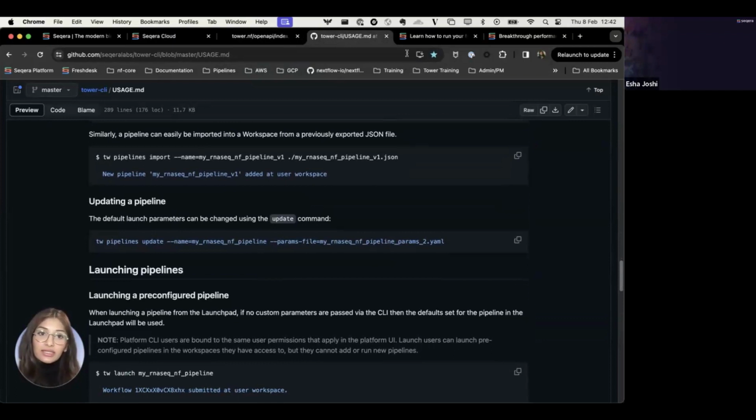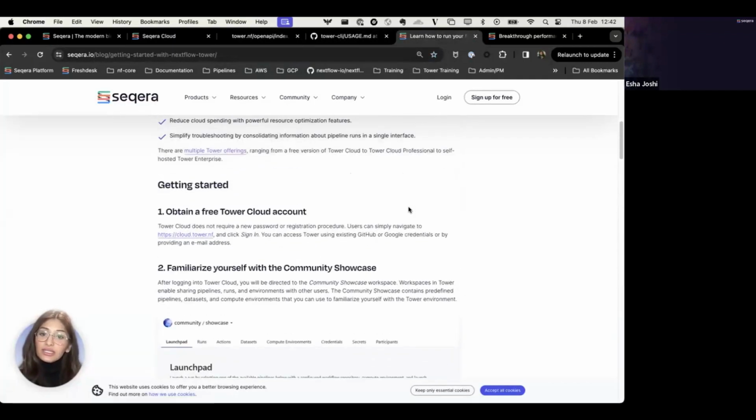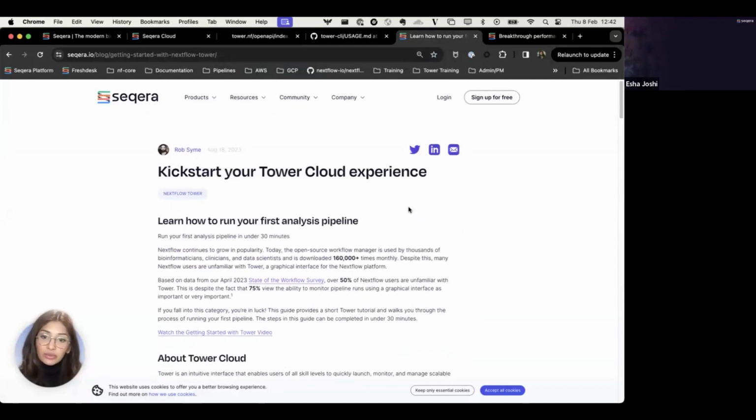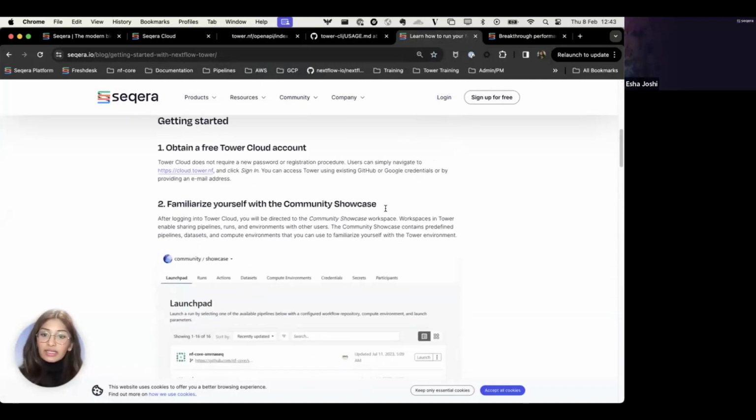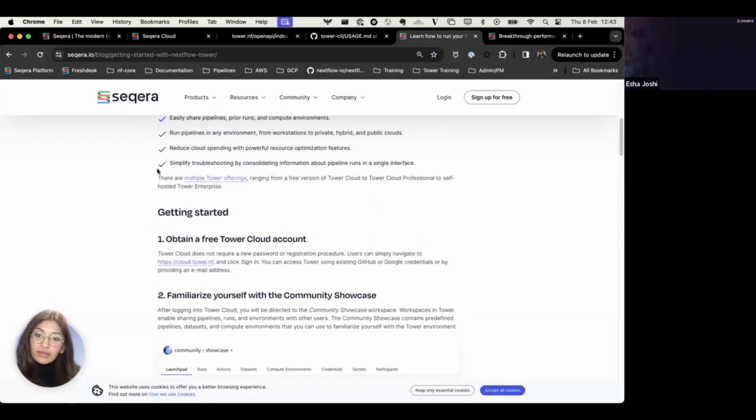And we also have a blog post that describes how you can easily get started with using Seqera Platform Cloud and describes the steps in getting you set up to be able to run your own pipeline in less than 30 minutes. Alrighty, I'm going to stop there and hand it over to my colleague, Rob.